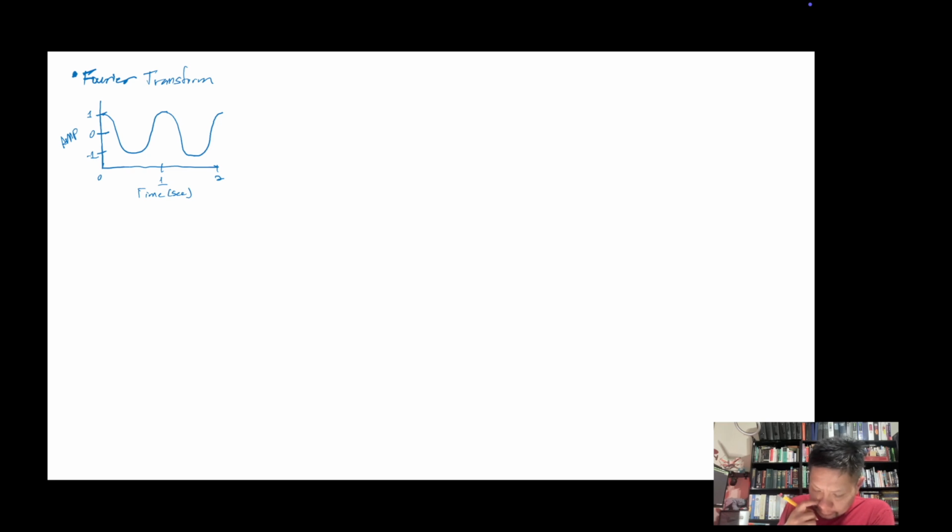And so the big secret about the Fourier transform, and I told you this before but I want to reiterate it now, is that all it really does is it's a mathematical operation that will transform or convert the time domain on the x-axis to a frequency domain. And so what does that look like? Essentially the same thing, but now on the x-axis we have frequency. And we'll start off with 0 over here, 1, 2, 3.